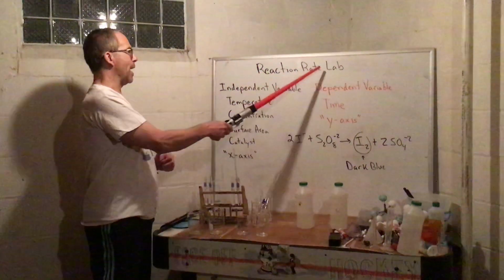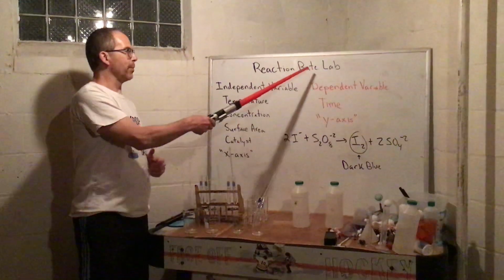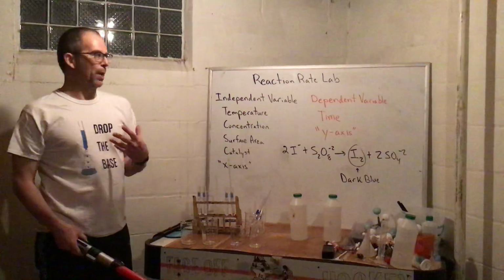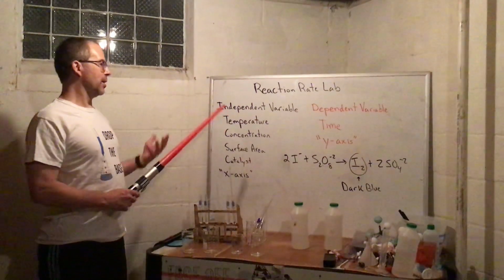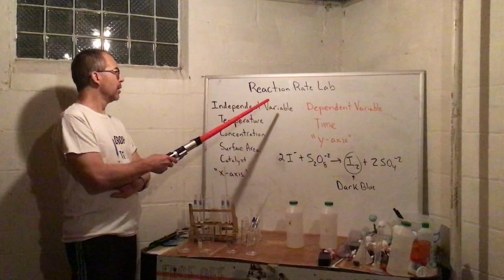Okay, reaction rate lab. So I handed out a reaction rate lab, and you're going to be performing your own experiment with this. I thought I'd go through maybe my thought process and how to set up this lab and work through it, and give you some ideas about things you can be doing.